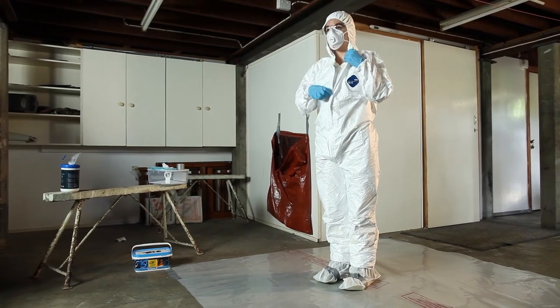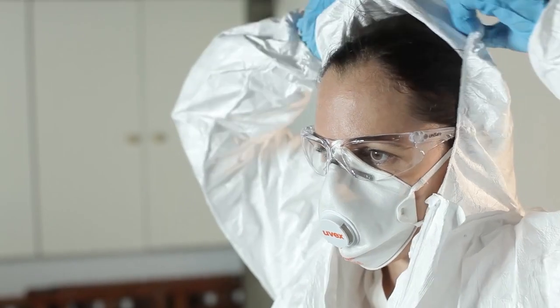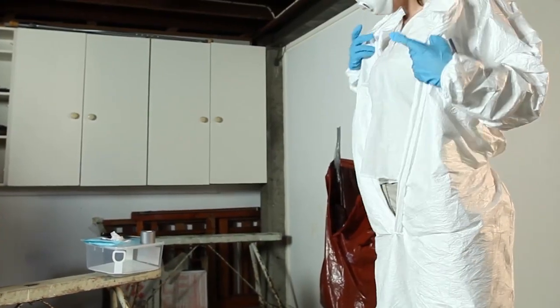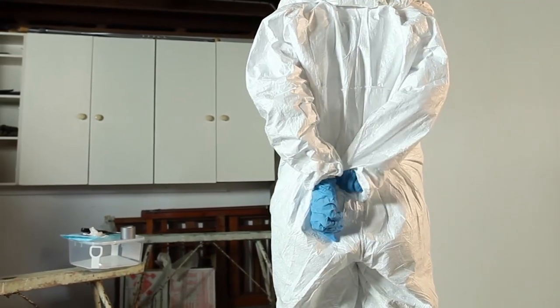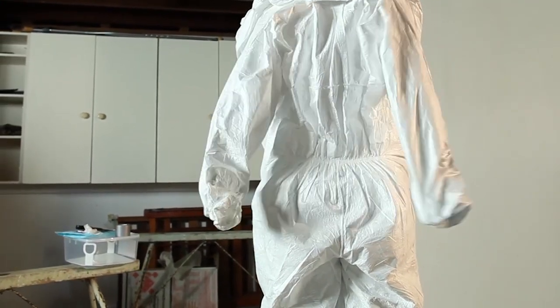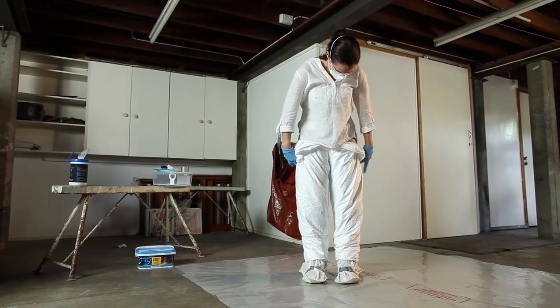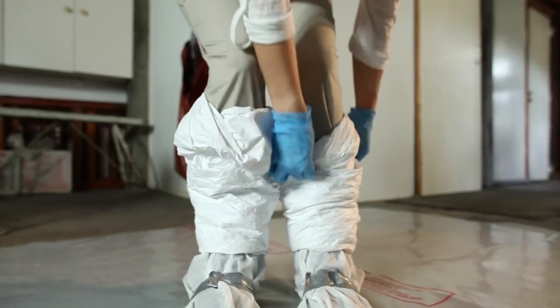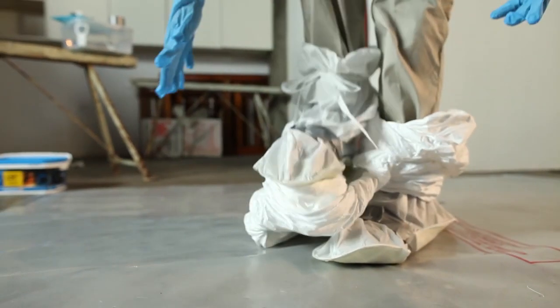Next, unzip your coveralls to the middle of your chest. Take your hood off by rolling it backwards on itself. Unzip the rest of the coveralls. Remove your arms by keeping them straight behind your back and pulling your arms out of the sleeves. Gather the sleeves and continue to remove the coveralls by rolling them inside out until they are around your ankles.